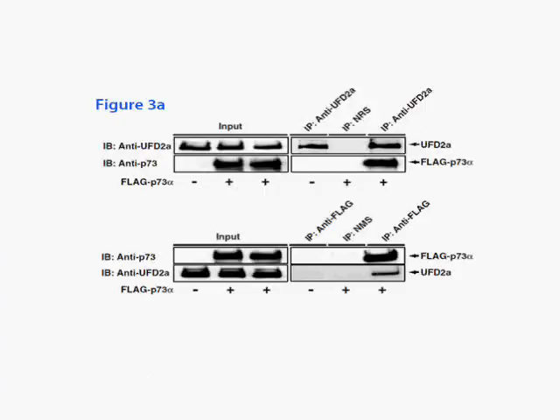Hey guys, this is figure 3a. Basically this figure shows that an interaction between UFD2A and P73 exists. First off, over here, these left panels labeled input are just controls. They show that UFD2A exists endogenously in the cells and in the lysate.